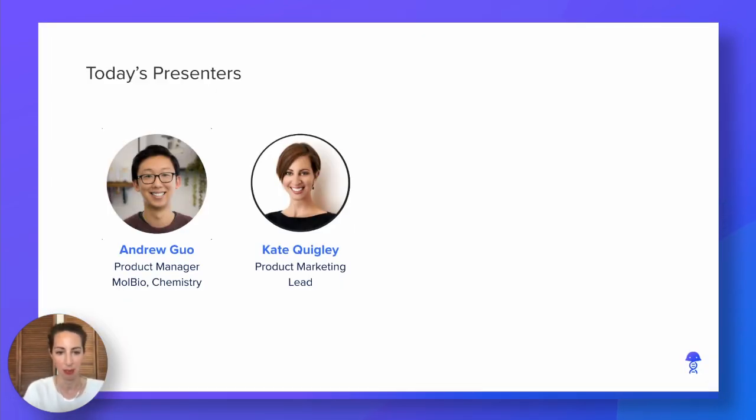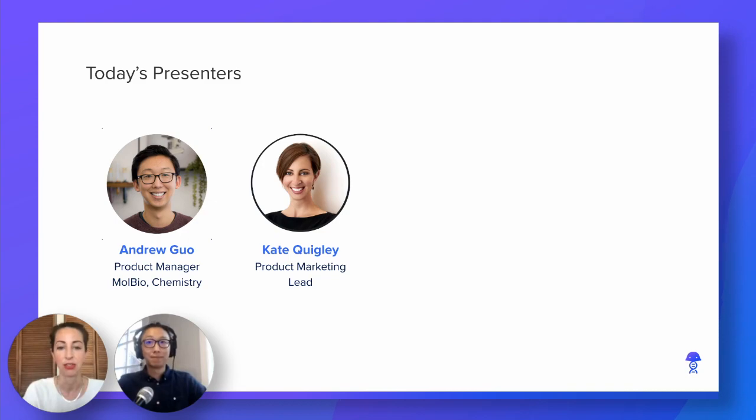My name is Kate Quigley, and I'm a product marketing lead at Benchling. Today marks our public launch of our RNA Therapeutics R&D solution, which we have been creating for this release. Joining me is Andrew Guo, lead product manager for the creation of the capabilities to support hybrid biologic and chemical molecules. Andrew, could you introduce yourself and tell us a bit about how and why Benchling is eager to support RNA therapeutics research? Sure thing, Kate.